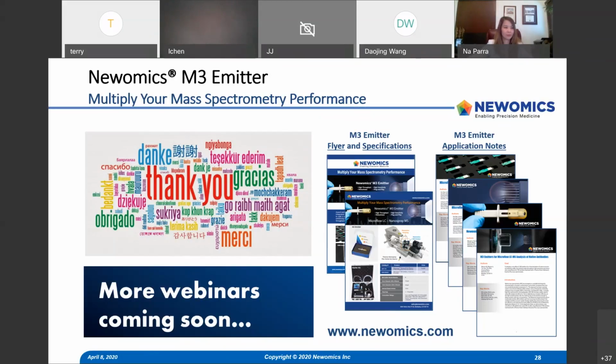Of course, there are also different angles you can take. You can deliberately reduce your signal if you are worried about saturation of your mass spec signal. I think the more direct way is to reduce the injection amount.